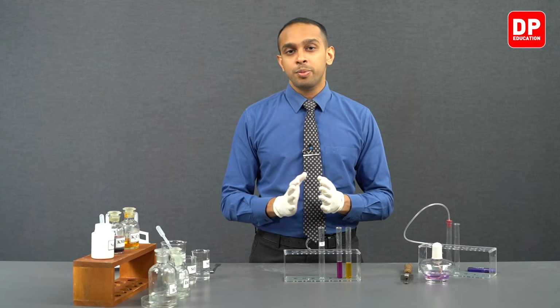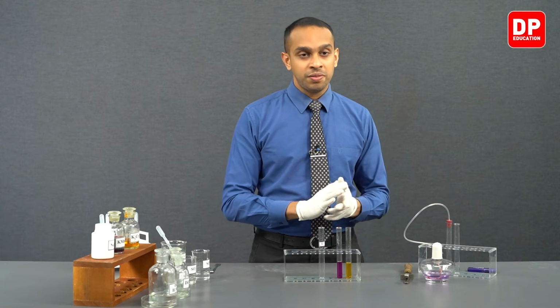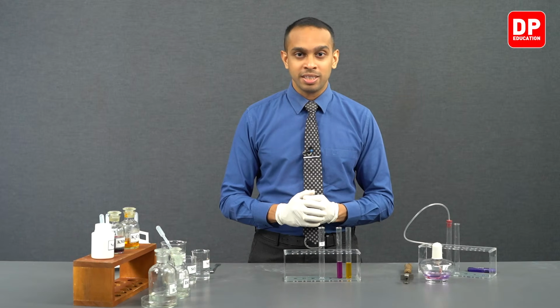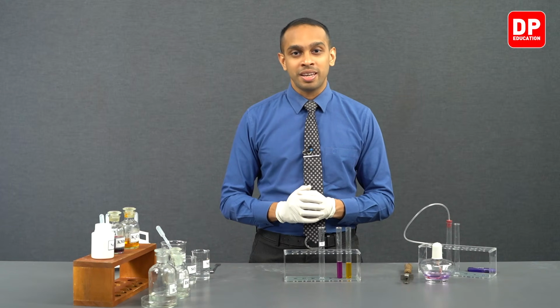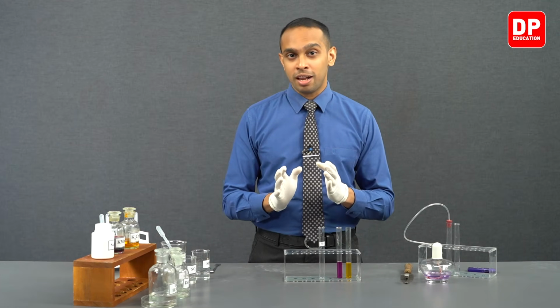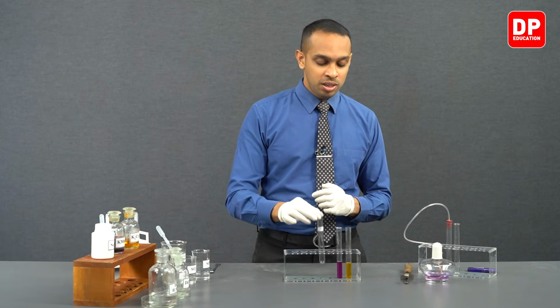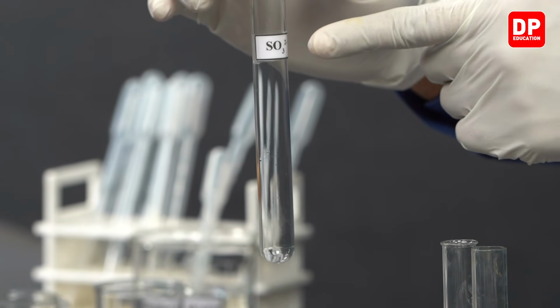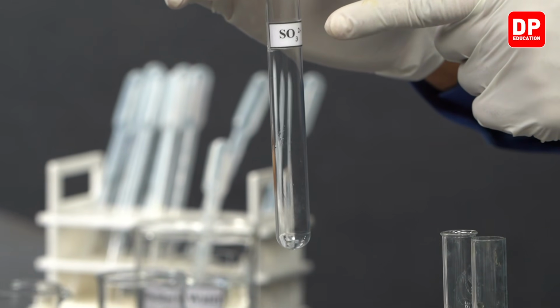Now, after preparing our acidified potassium dichromate and acidified potassium permanganate solutions, we can move on to taking a solid sample of sodium sulfite into our test tube here. You can see we have labeled this test tube sulfite ions.